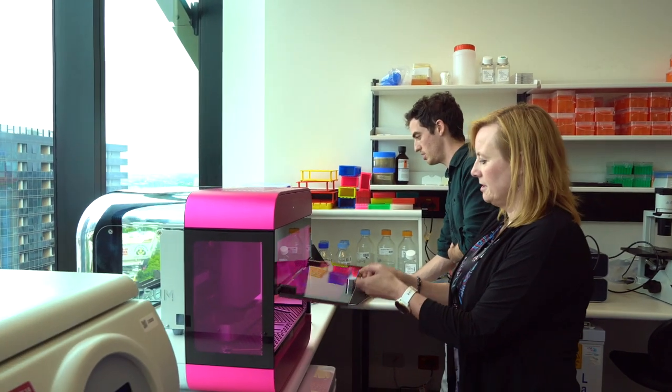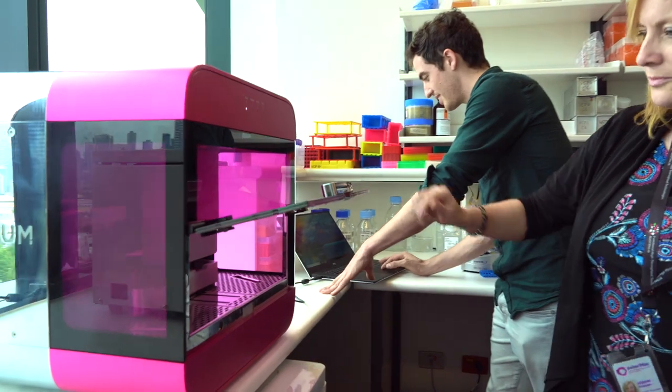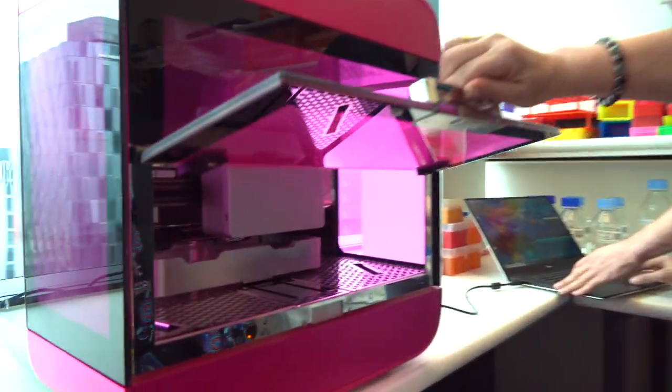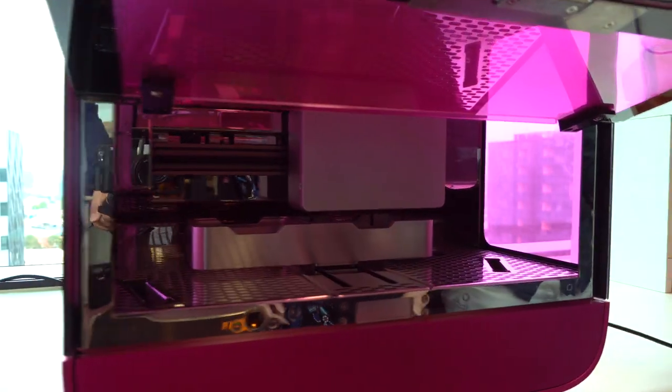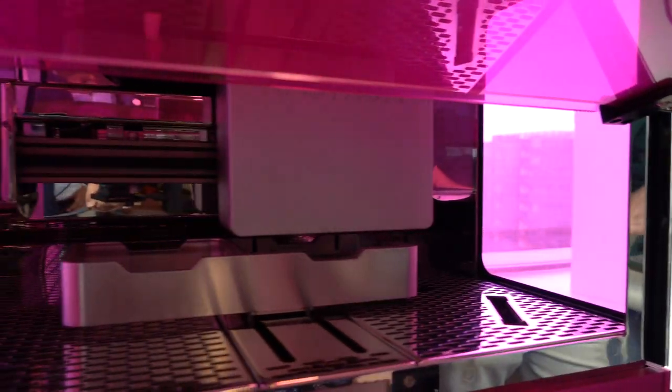We've taken possession of Australia's first 3D bioprinter from the company Invention of Life Science. The instrument's called the Rastrum. Beautiful pink box, very nice styling. We're all very impressed with how it looks, and even more impressed are we about its functionality.